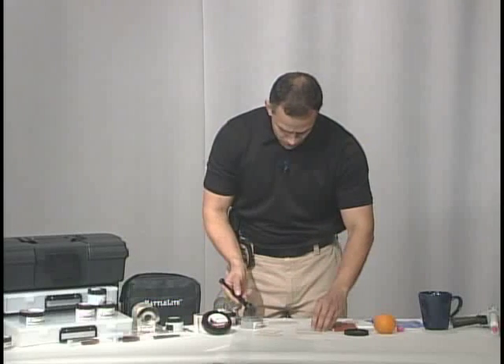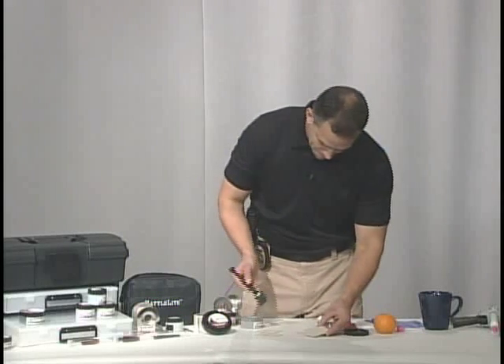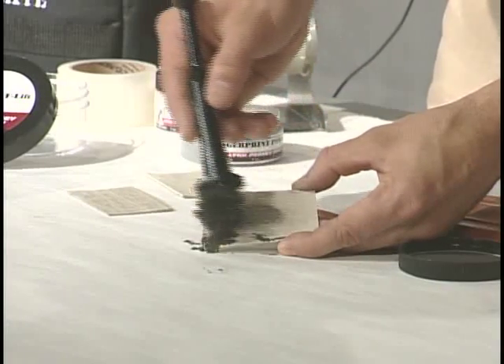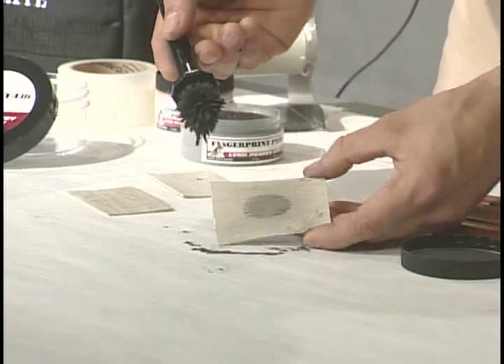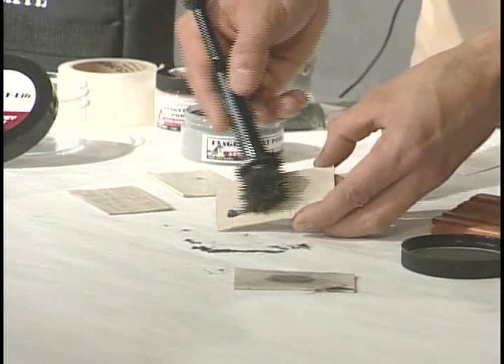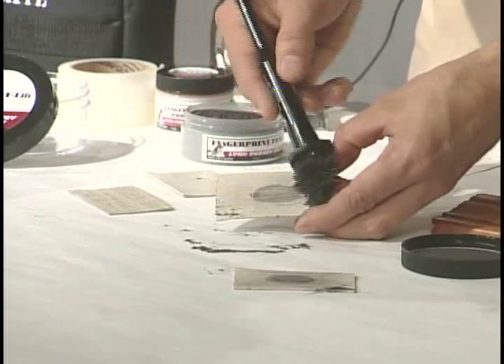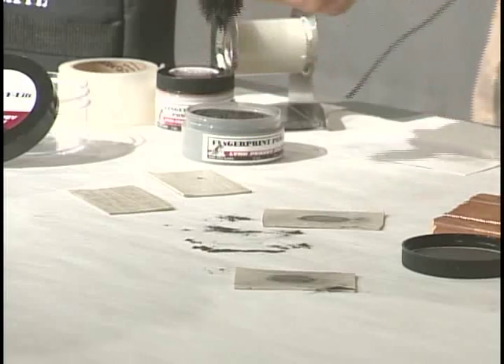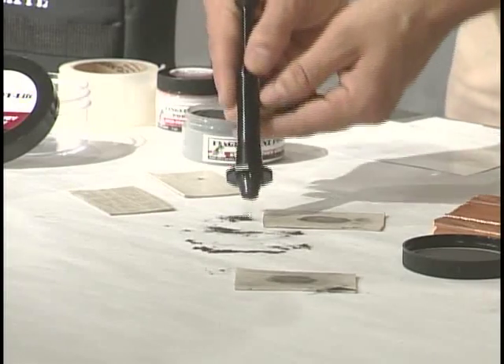Put the applicator to the powder, and I'm going to brush over our items. Now, I'm going to do this more than once, because I'm going to show you some different techniques to lift these once they're developed. I'm going to go back and do our cleanup.